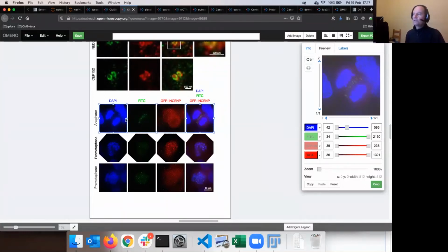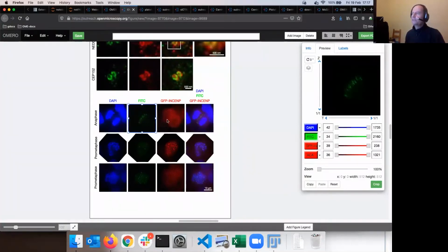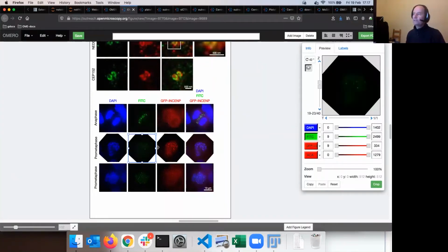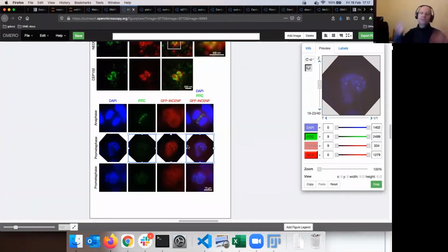So what I should have been doing is always selecting the images before adjusting those parameters on single channels. And now they are getting in synchronization. So it's not copying, instead it's like multi-selecting the things between which you want to copy. And when you move this bar the first time, things get into the same sync. Okay, so that's the way to do that.